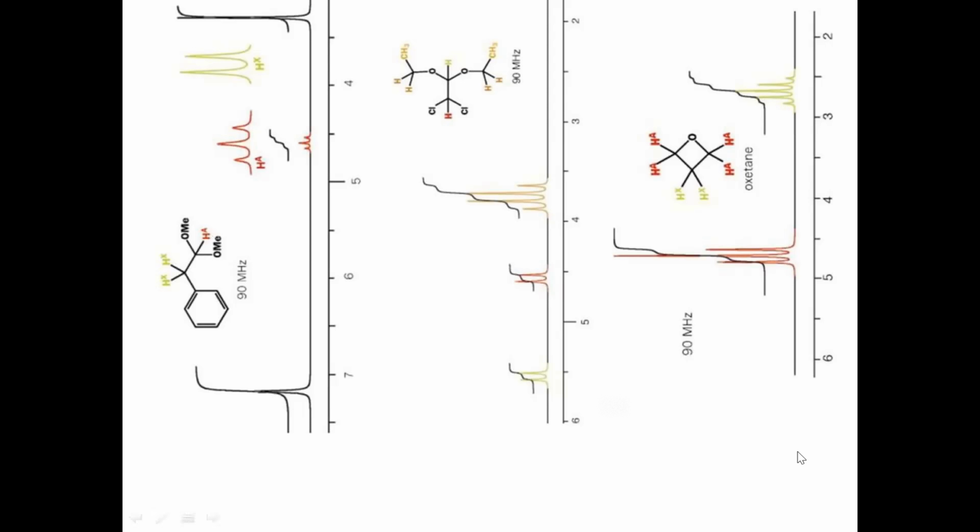And this NMR spectrum has been carried out at 90 megahertz. What is the difference between 90 megahertz and 100 megahertz, 500 megahertz? When you apply 90 megahertz, the peaks will appear near each other, meaning compactness will appear. But in the case of 500 megahertz, the distance between two peaks will be large, okay. So you can interpret it very easily. Similarly you can see this spectra.